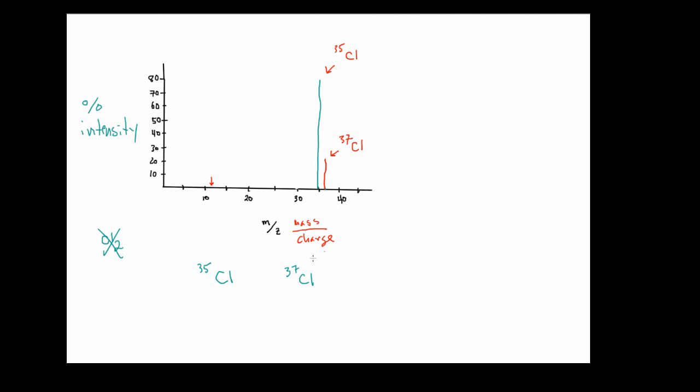And the Cl2 peak obviously is going to be somewhere out in this region, right? Because this 40 here correlates with a molar mass of 40, and the Cl2 is going to be out here somewhere around 70.9. But we're just going to focus on the isotopes that are here.